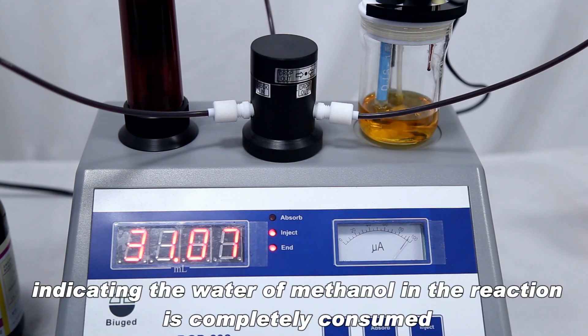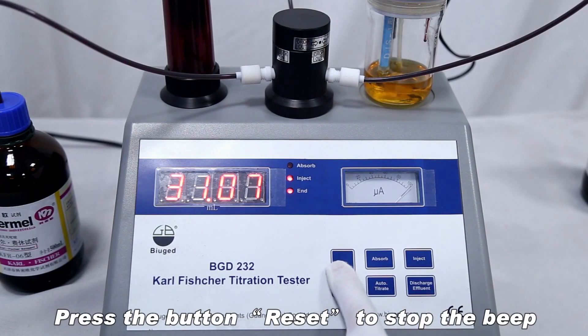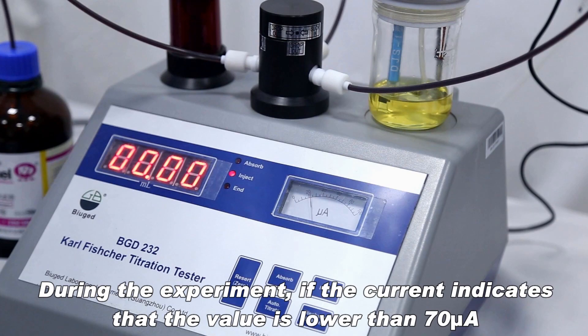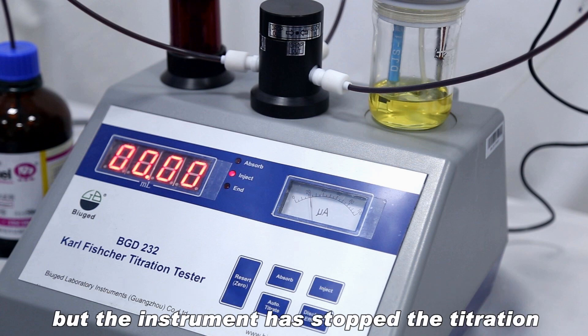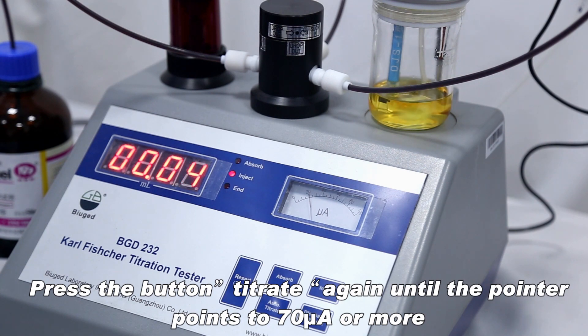Indicating the water of methanol in the reaction is completely consumed, press the button reset to stop the beep. During the experiment, if the current indicates that the value is lower than 70 µA but the instrument has stopped the titration, press the button titrate again until the pointer points to 70 µA or more.